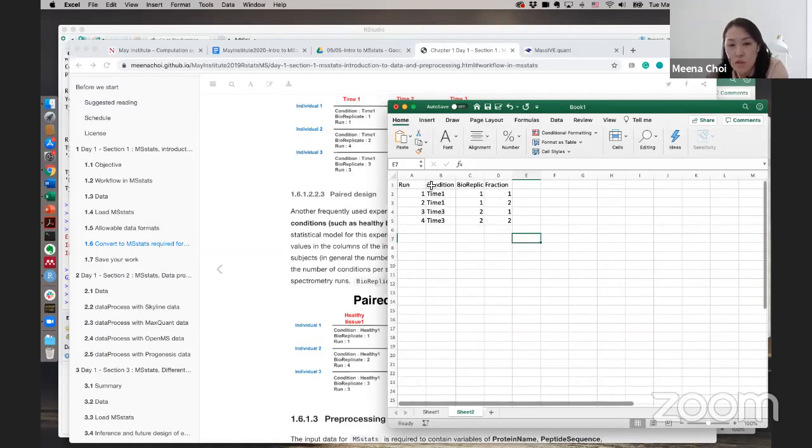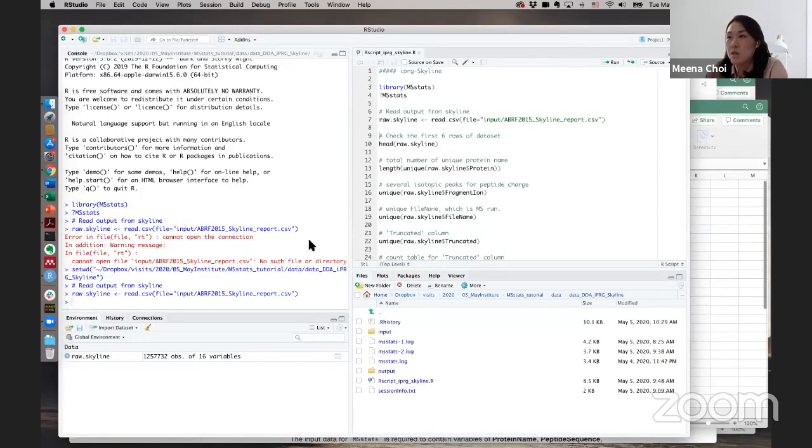So based on this annotation, we actually recognize all the design automatically, and then we just find the best design. Okay, so now this one is done, but I will just double check if you have any question about this annotation part.